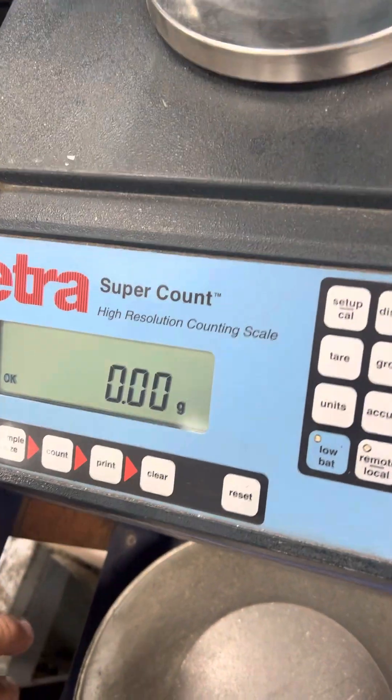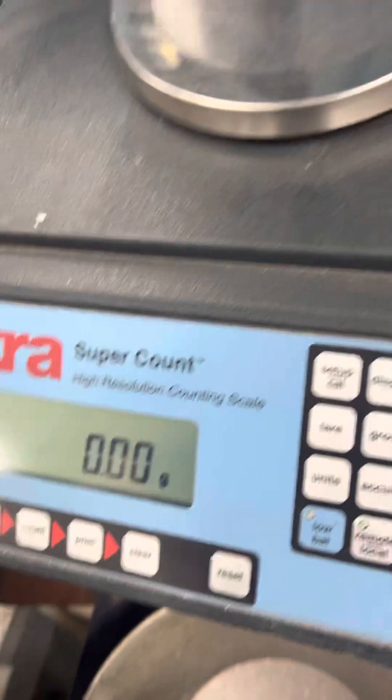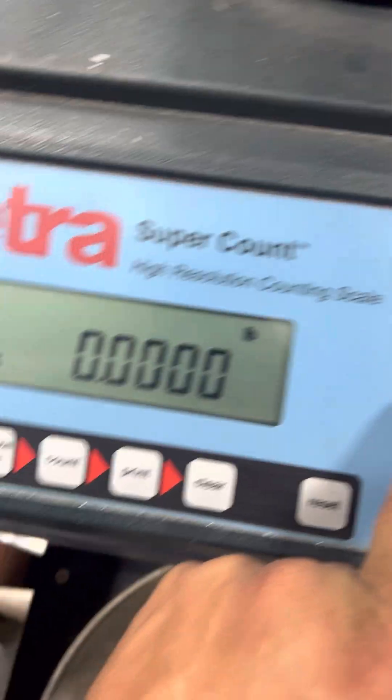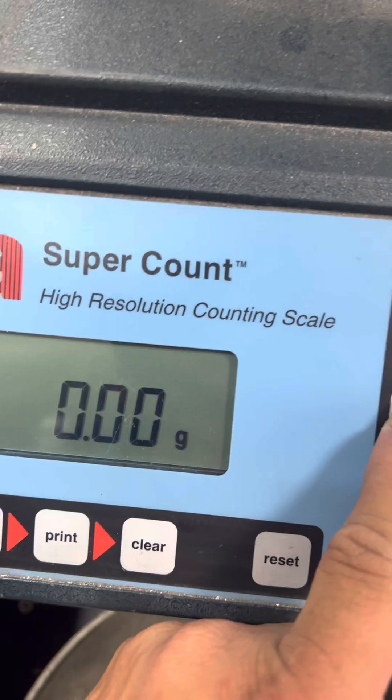So this is how to change units on a CETRA super count. Basically when you press the units key it changes from pounds to grams. Those are the only two that are actually programmed for this.